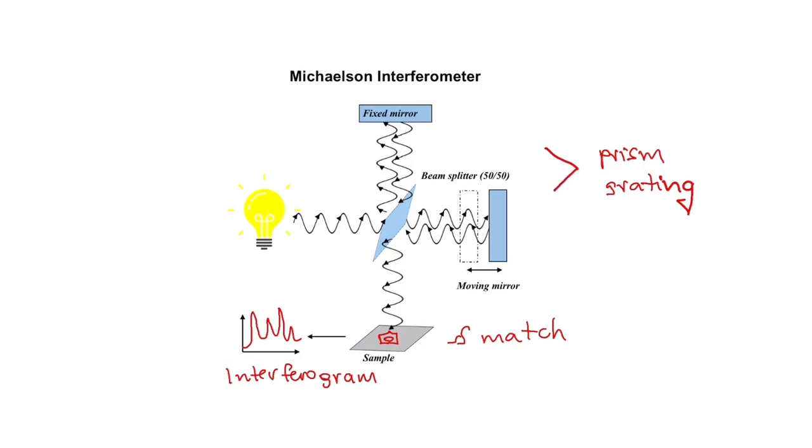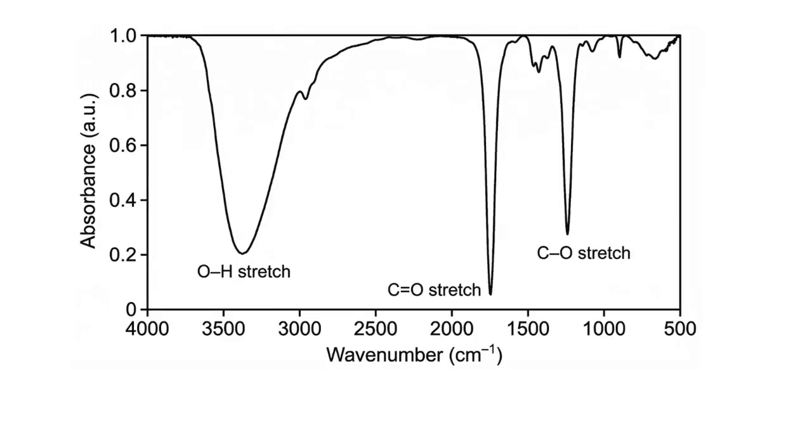What's powerful about FTIR is that each peak tells us something unique. The position of a peak tells us the vibration frequency, basically how stiff the bond is and how heavy the atoms are. The intensity reflects how much the dipole moment changed during the vibration. The shape of the peak tells us about the environment of the bond, hydrogen bonding, or whether the vibration is coupled with neighboring bonds. In other words, an FTIR spectrum is like a full molecular biography written in vibrational language.